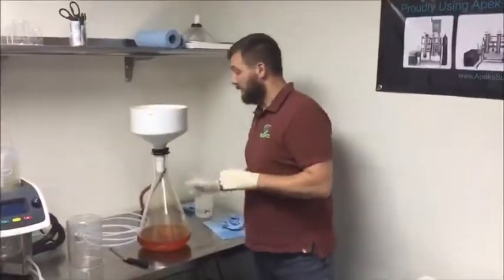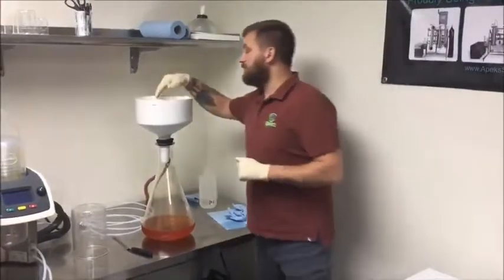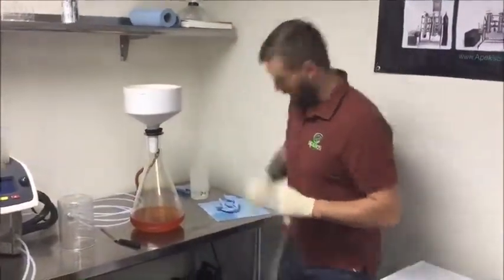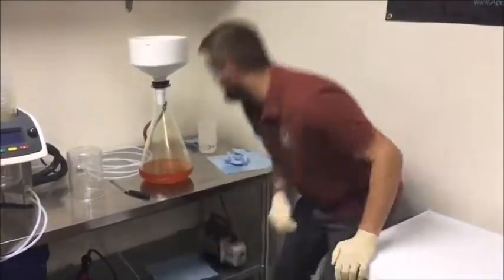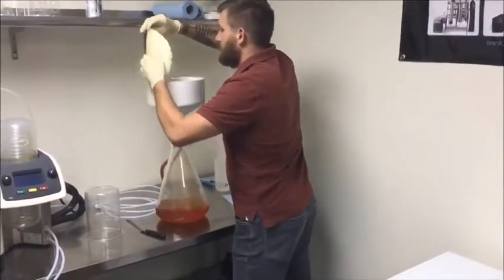So now that we're pretty much done filtering, you see a little bit of drips here, not much. On top, there's nothing but white wax left on the filter paper. We're going to turn off our vacuum pump. We're going to remove our filter paper.